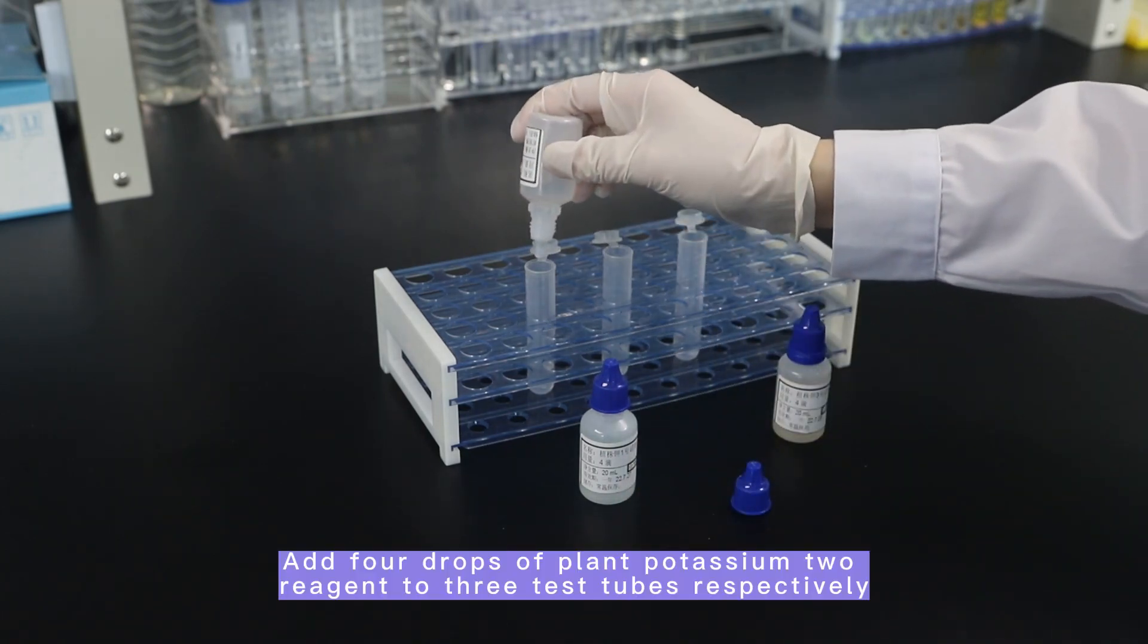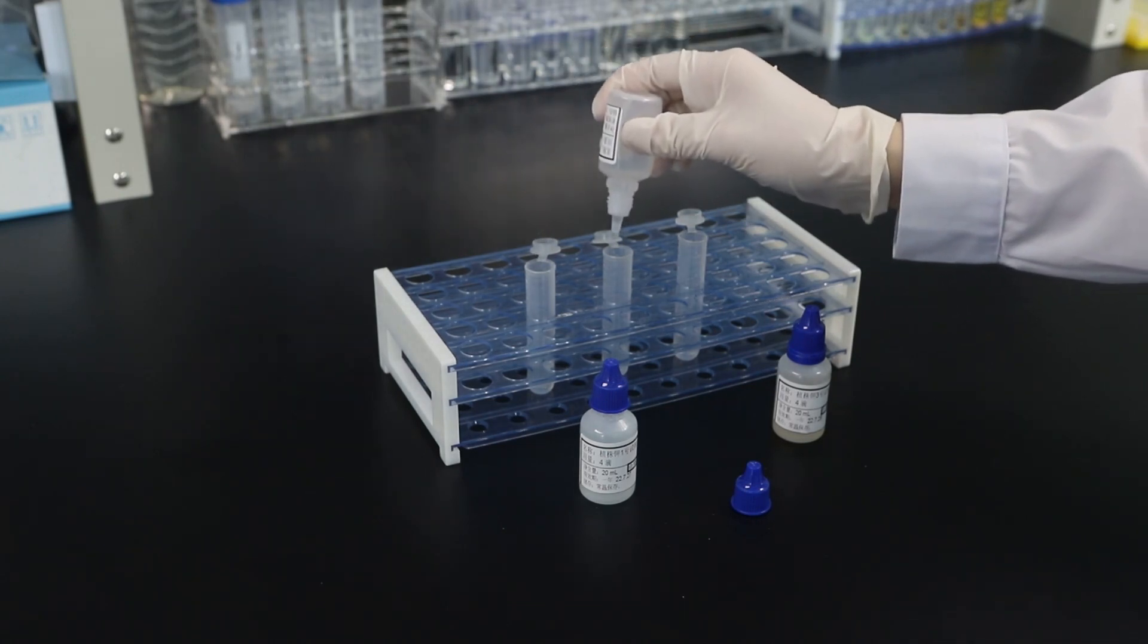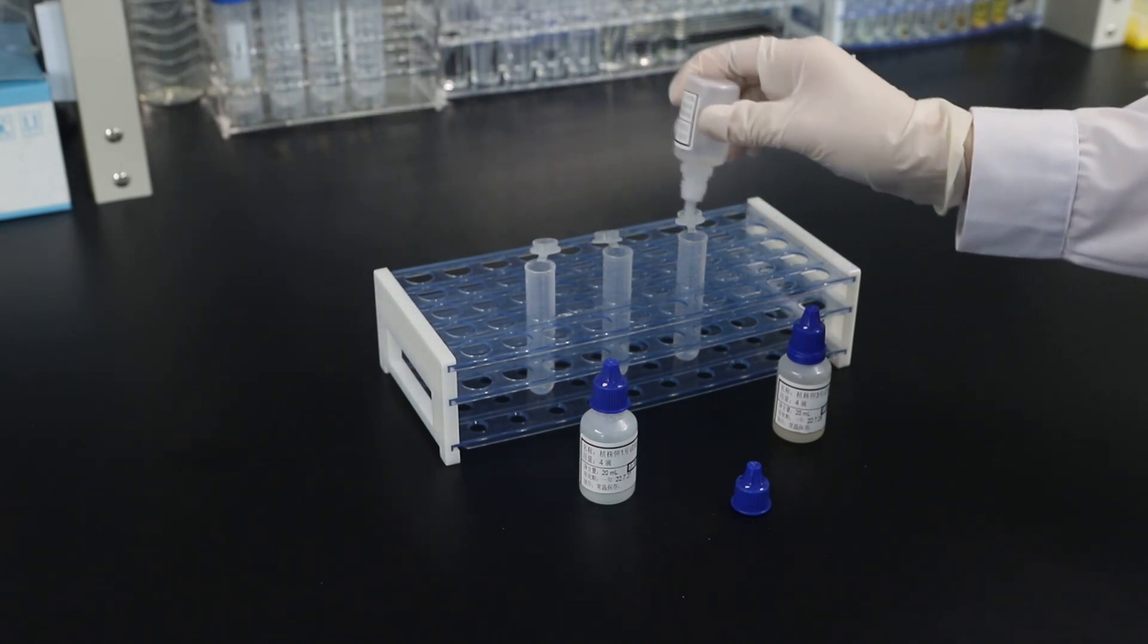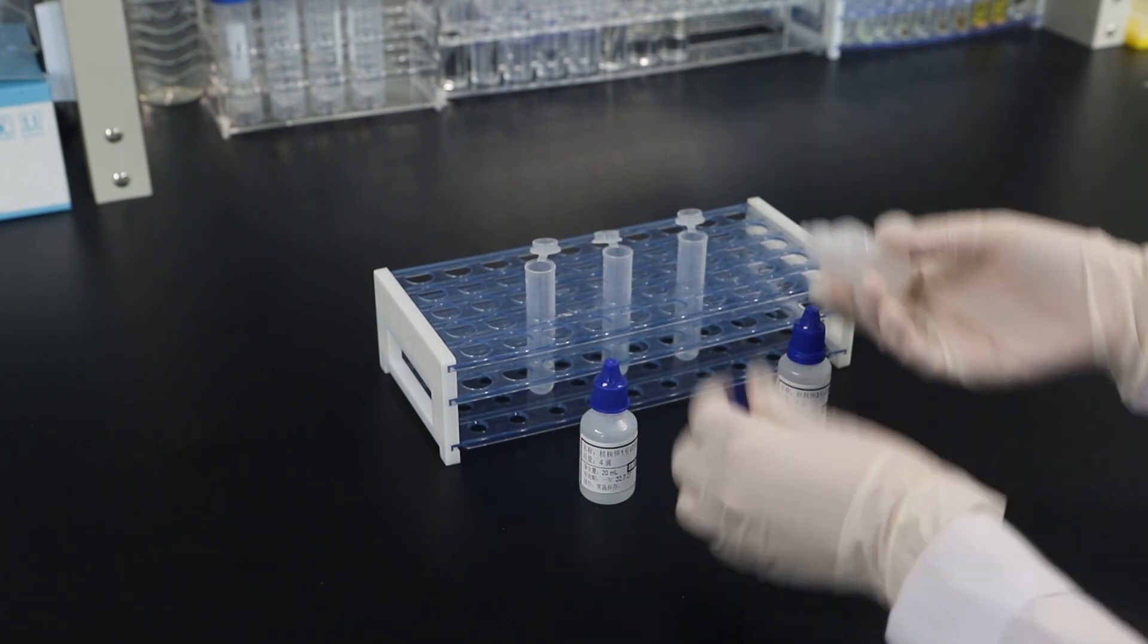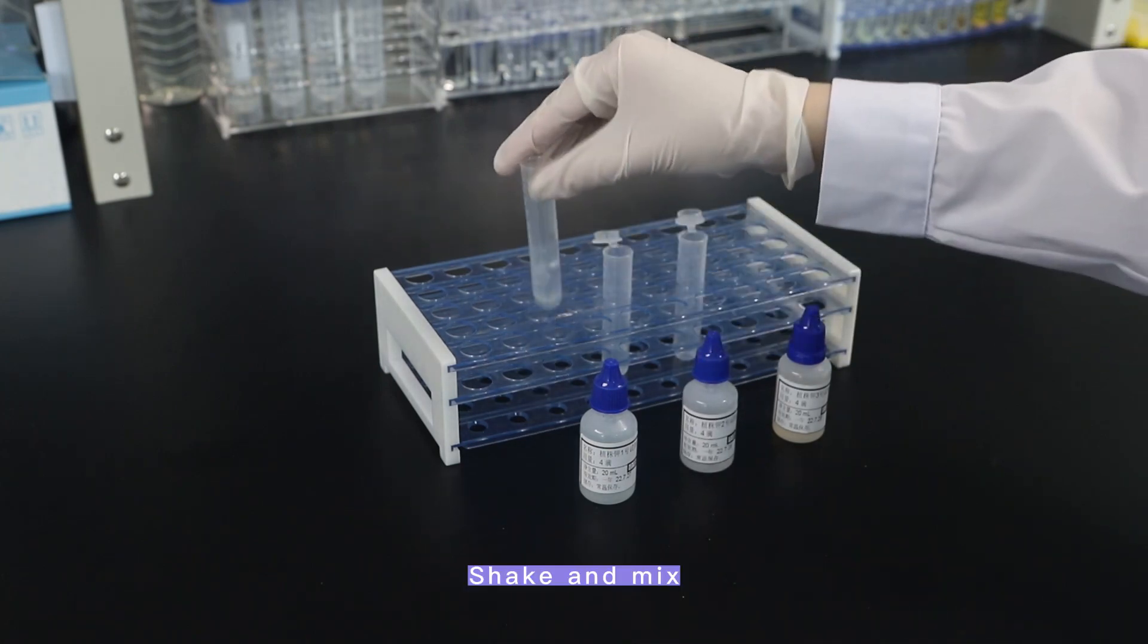Add four drops of plant potassium two reagent to three test tubes respectively. Shake and mix.